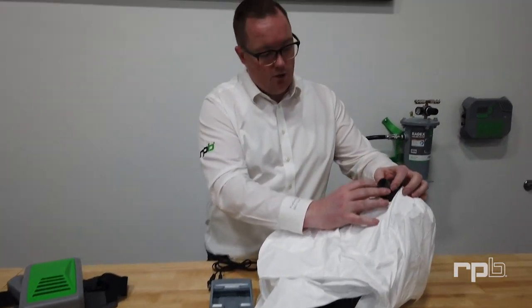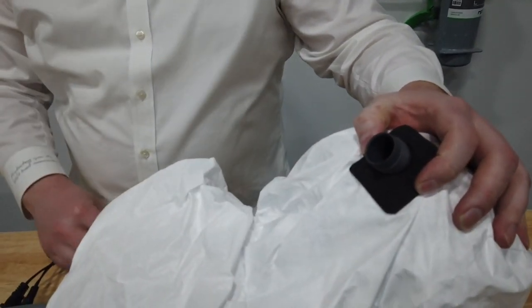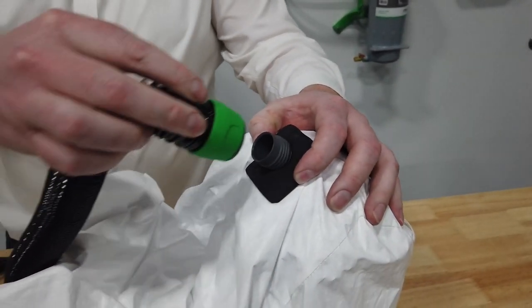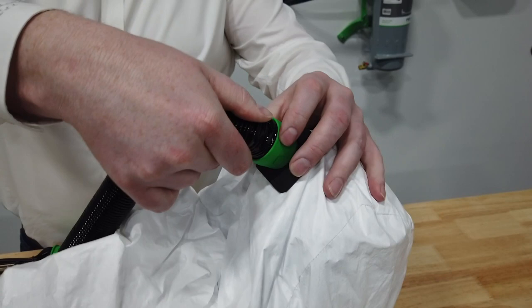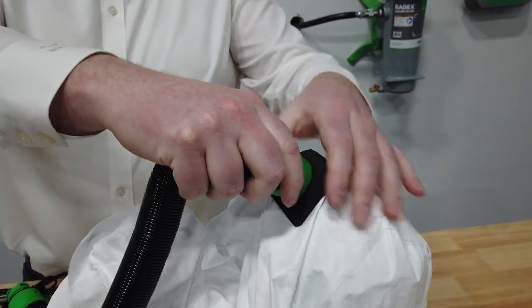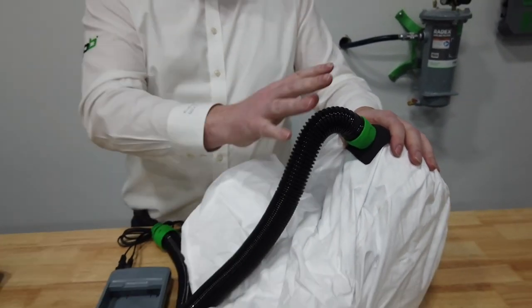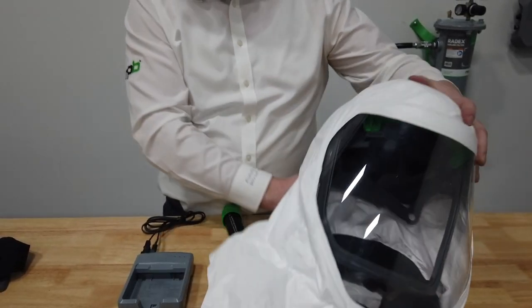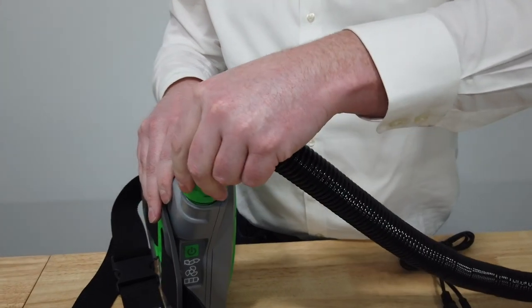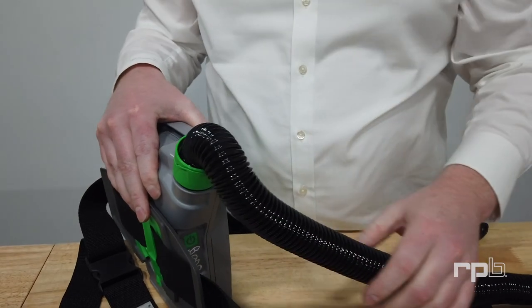To attach the breathing tube, attach it first to the inlet on the T-Link with the threaded end of the breathing tube. You want to make sure this is done up tight so that there's no potential leakage getting inside the hood. Once you've got that end done, you can then attach the bayonet end to the PX5 — that presses in and twists until it's locked in position.